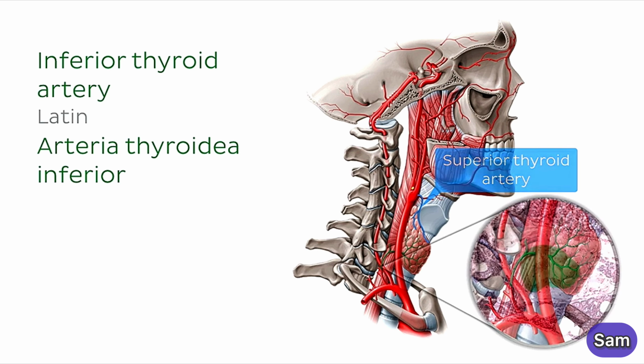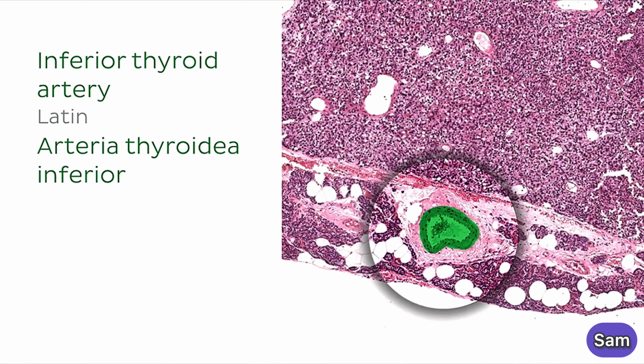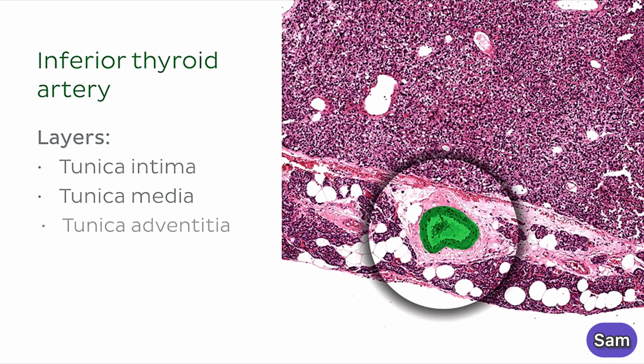We can see a cross-section of one of these small arterial branches highlighted now. When looking for arteries in histological sections, start by finding a lumen typical of blood vessels, but one that is surrounded by a much thicker layer of tissue than, say, veins. Arteries have clearly distinguished layers, the tunica intima, media, and adventitia, which can often be identified in histological images as well.